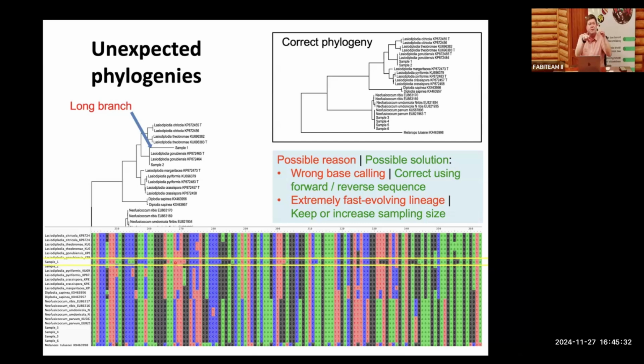When you have a T, sometimes it calls more T's or fewer T's. That really depends on the chemistry. But many times we have a T, and you will find that there's another peak for a T, and the program read it as a T. But it's not a real T. It's just because there was overflow during the migration, or the movement of your nucleotides.